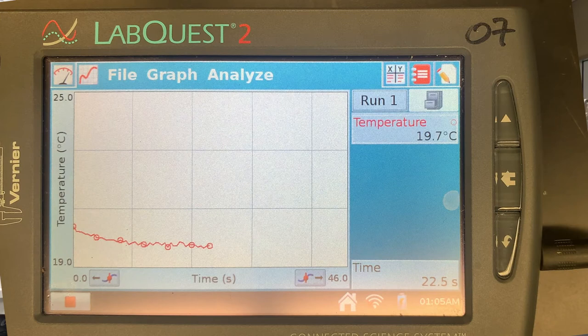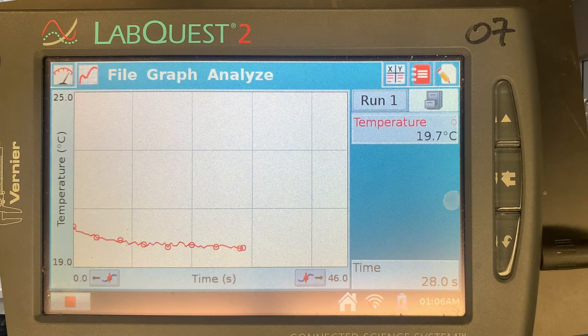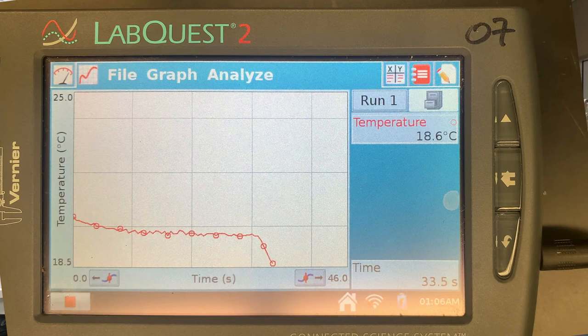We will first measure the initial temperature of the water. The initial temperature is about 20 degrees Celsius. We will now add our 3 grams of ammonium nitrate.